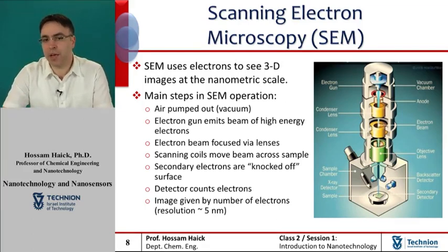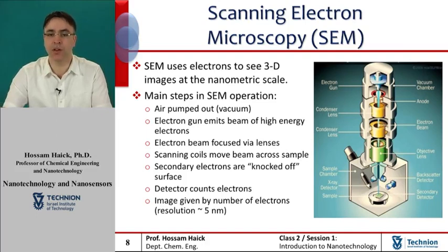In a typical SEM, an electron beam is thermionically emitted from an electron gun, such as a tungsten filament cathode. The electron beam, which typically has an energy ranging from 0.2 kV to 40 kV, is focused by one or two condenser lenses to a spot about 0.4 nanometer to 5 nanometer in diameter.